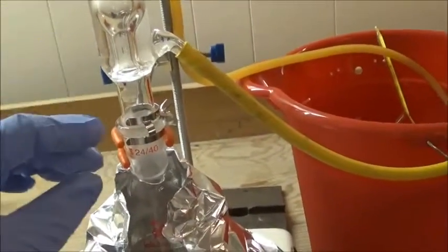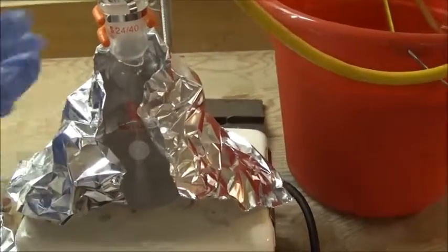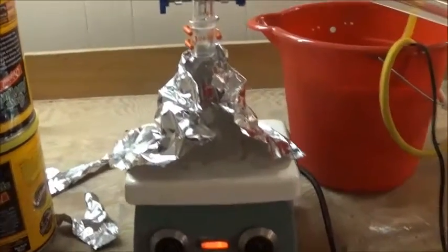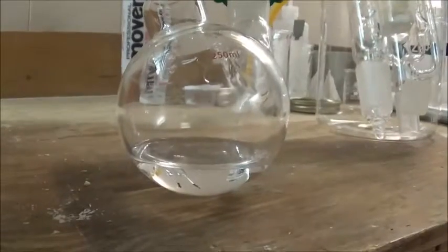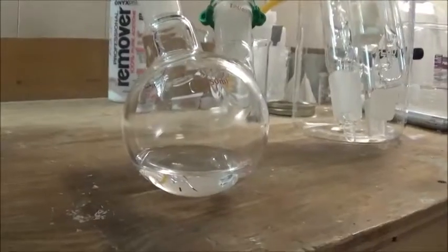So I let everything cool down, put on a different condenser, and now we're just going to do it the normal way. It's been quite a long time, and now I've set up for simple distillation to remove the ethanol. I distilled off as much ethanol as I could before the vapor front of the ethyl salicylate started moving up the flask.